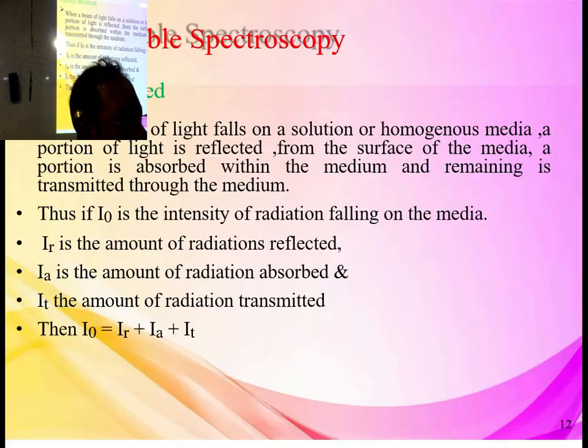So you are changing first the concentration of the solution, then intensity always increases. You have taken a cuvette. In this cuvette, you have added 10 microliter of solution sample. You got a certain peak. You want a higher peak, you add 10 microliter more, you get a higher peak. Quite natural. Same solution, but you have added more. That means higher concentration. Practically we do this. First I add 10 microliter, take the peak. Then it's not satisfactory, very low. I'm not happy. Then add another 10 microliter. Then you will find, okay, this much of a peak I have got.